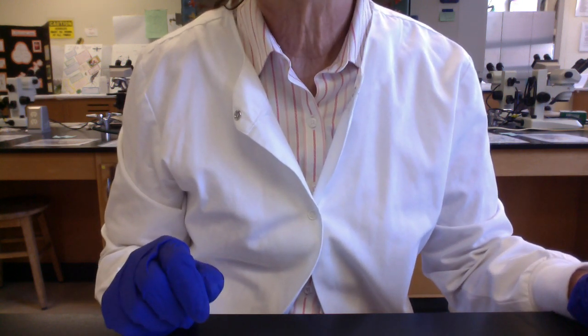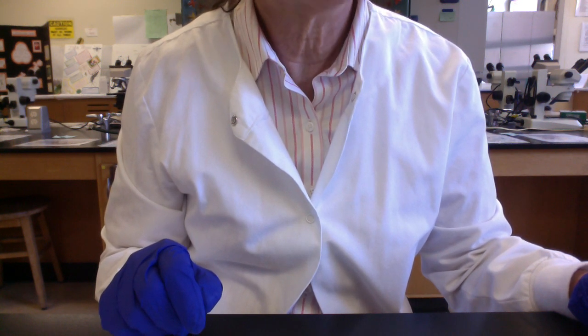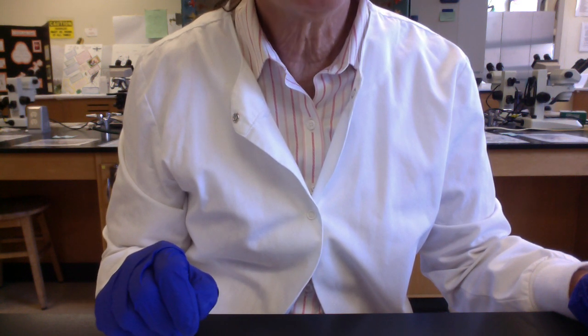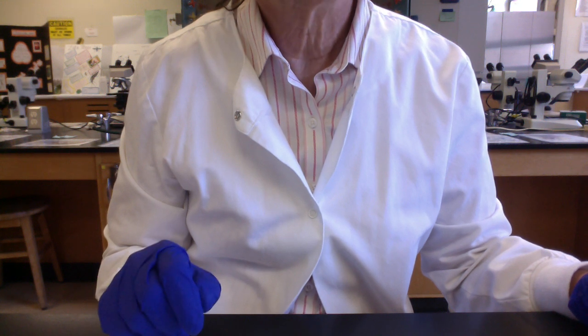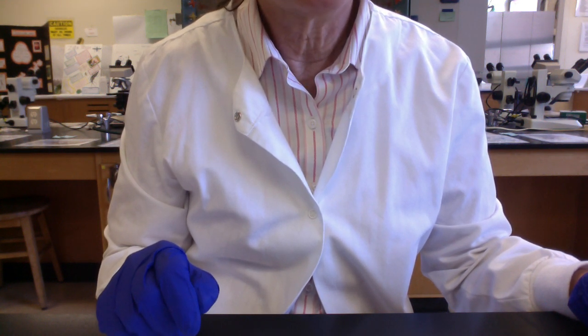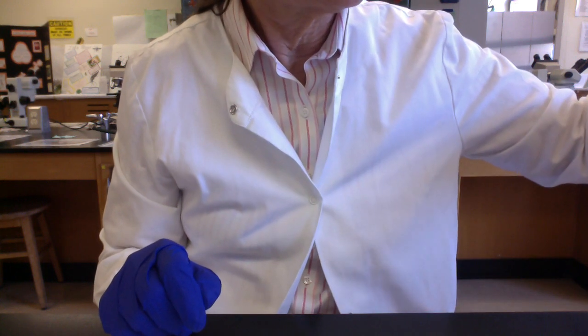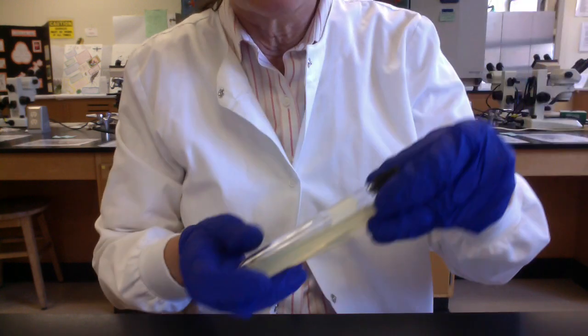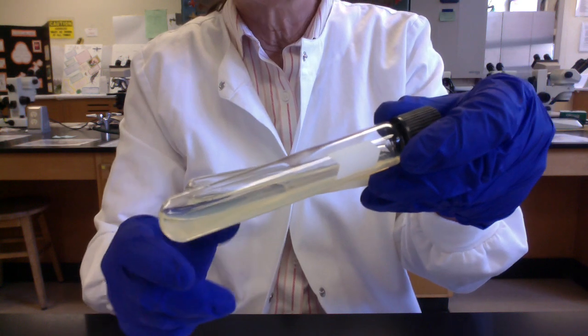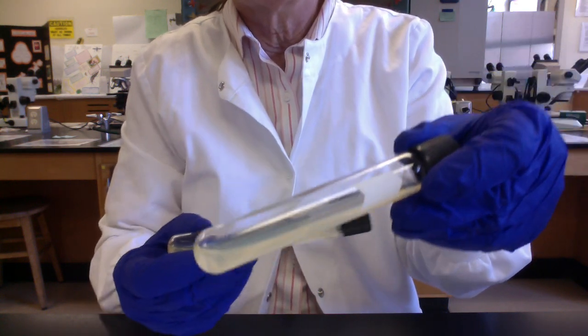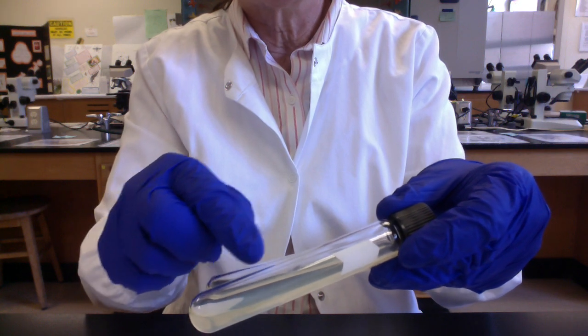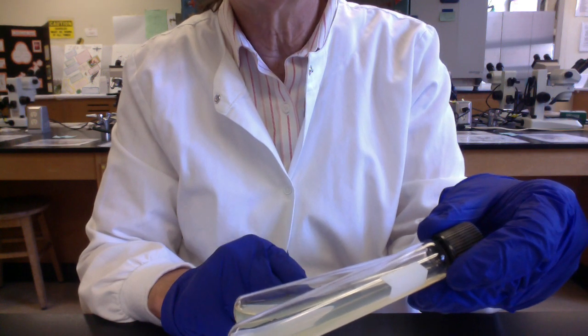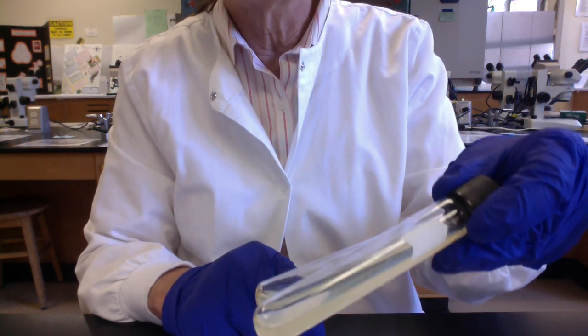What we can now do to make solid media, the most common solidifying agent is agar. We can add the agar before we autoclave the media. And then when the agar comes out of the autoclave, it will still be hot and liquid. So what we can do is if the medium is in test tubes, we can choose to let the agar cool and solidify at an angle. And this will create an agar slant. Agar slants are nice because they have pretty big surface area. We can inoculate, transfer our bacteria to the surface of the slant and let them grow aerobically. So this is a nice, efficient way to grow our microbes aerobically.